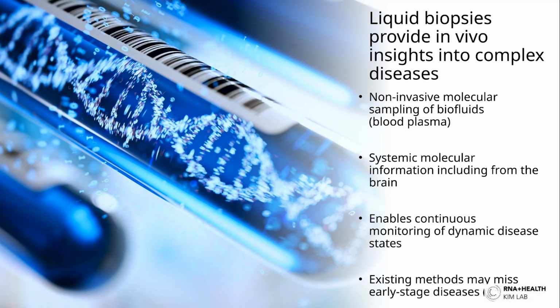And so these extracellular vesicles, such as exosomes, have been demonstrated to cross the blood-brain barrier. So you're even able to get information about different types of cancers in the brain or even neurodegenerative diseases, which my lab has also been studying. And so the great thing about this approach of using a liquid biopsy is it really enables continuous monitoring of these very dynamic and evolving disease states.